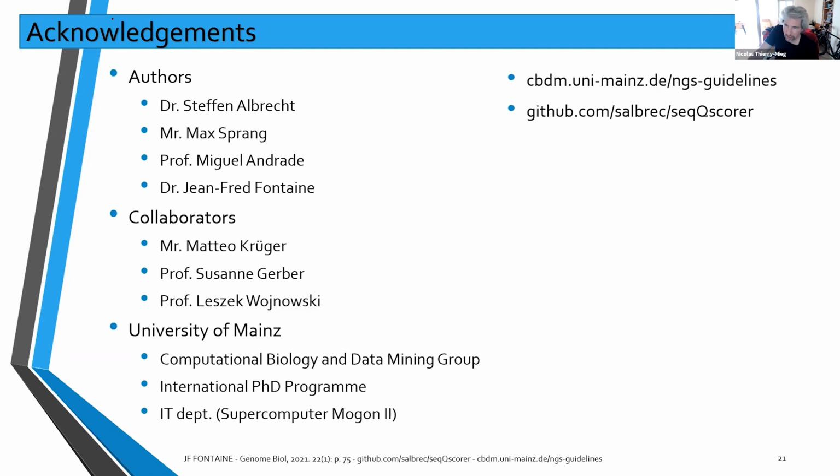Elias is asking, since you're using random forest, is it possible to extract the features that led to the classification for troubleshooting? Yes, we did it in another paper. The mapping statistics are very powerful in this set of features. So the Bowtie number of uniquely mapped reads, overall mapping statistics, and the FastQC also come out very strong. And the two others, location and TSS, are maybe useful, but more for specific subsets.